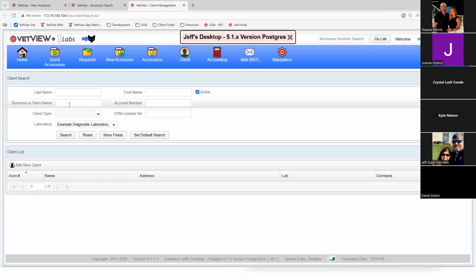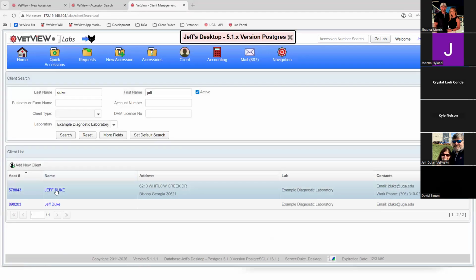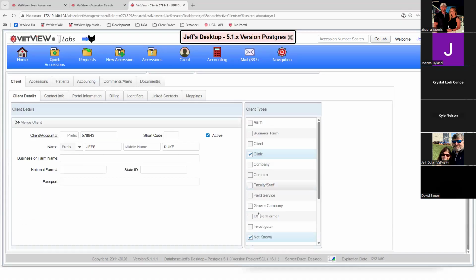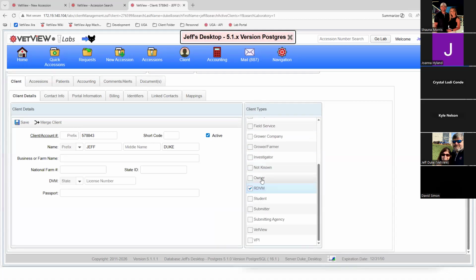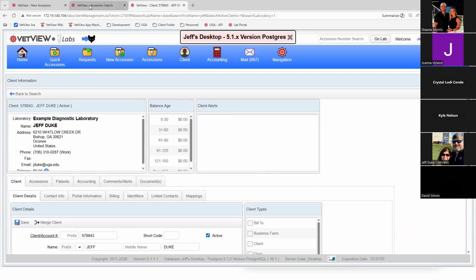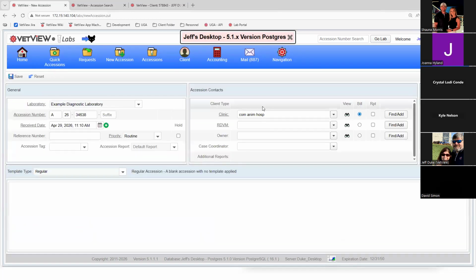We'll jump over and look at one. I'll just pull myself up here in the system. So down here in the client types, you can see I can have multiple. So maybe I'm a clinic as a submitter, or maybe I'm both an RDVM and an owner. I can have as many types associated with a client as well. Again, it's just acting as a filtering mechanism in the system. All right, coming back here.